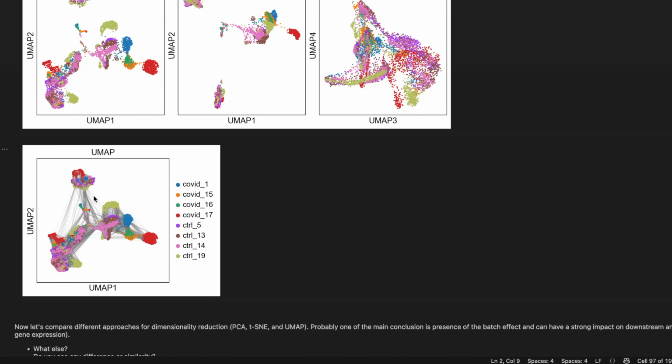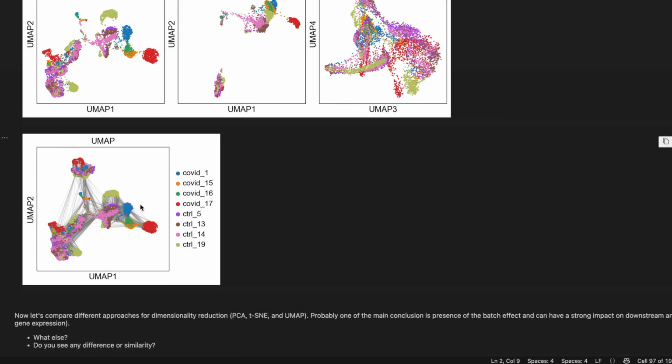And last but not least, as I showed you, we first calculate the neighbors, or how connected or how similar the neighbors are. This picture here, with the lines or edges, shows how close or how similar given cells are. The thicker the line, the stronger the correlation or similarity between the cells.